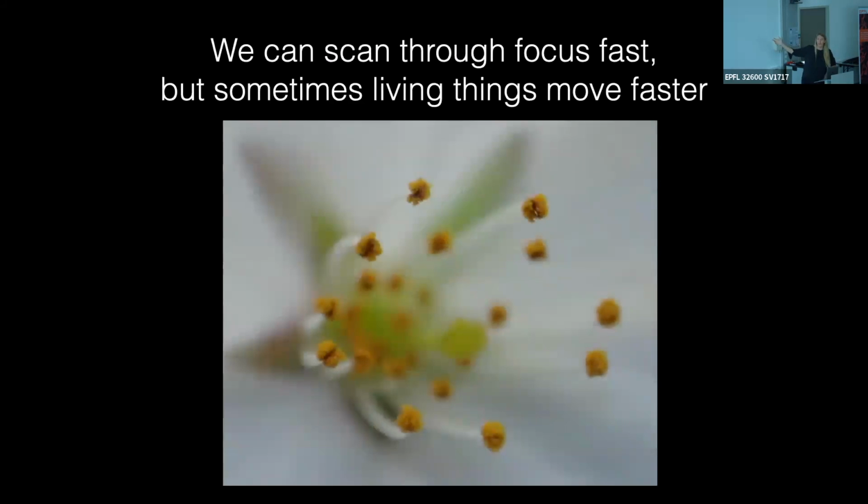So we didn't hurt any flower in this experiment. It was on the tree. So you can see that it actually moves a little bit. And that's very realistic when it comes to microscopy too, because your sample is moving. And if you're trying to scan by refocusing through the sample with a very, very thin focus depth, you may, even with really fast galvos and scanning system, run into the problem that your sample is moving, which is why a lot of imaging is done in 2D.